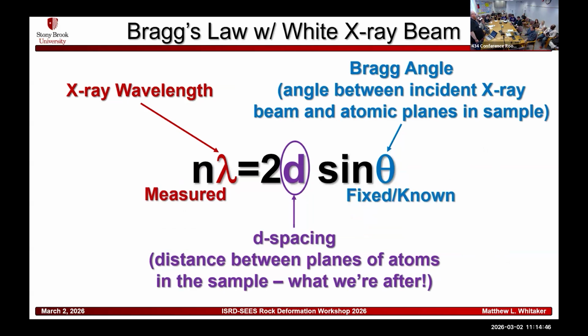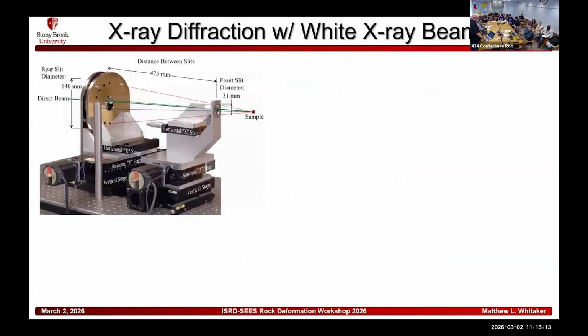So we have an energy dispersive detector, a germanium crystal that's capable of measuring the energies of all of the photons that hit it and separating those into bins. And that is what's going to give us those nice 1D diffraction patterns that we were looking at before. The one thing that we give away with this is we don't have that full ring like we get in monochromatic beam. We have our detectors oriented at specific angles here.